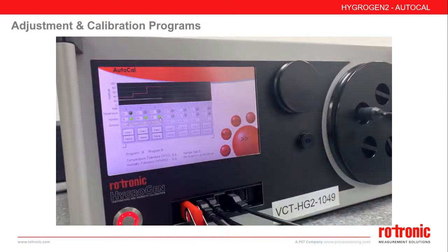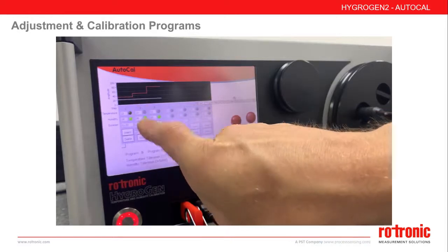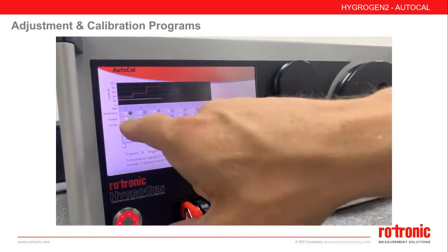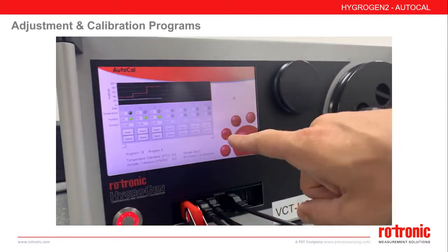data and apply adjustments. By selecting these 3 points, AutoCal will acquire humidity conditions at each step and apply the adjustment to the probe at the end. In this case, this would be a 3-point humidity adjustment with no temperature adjustment.